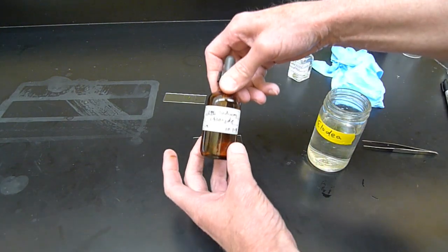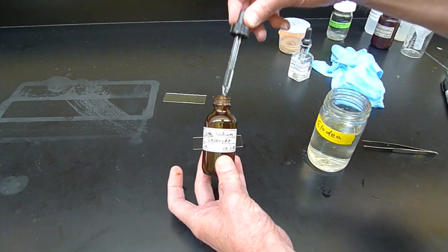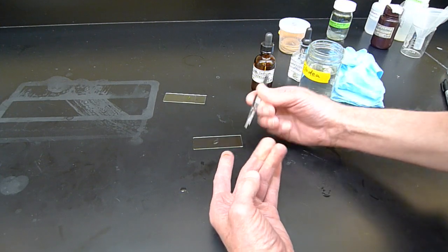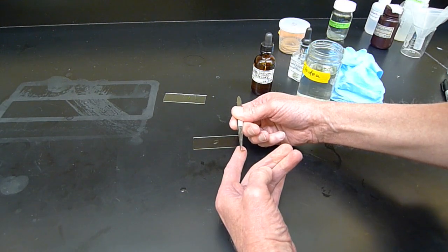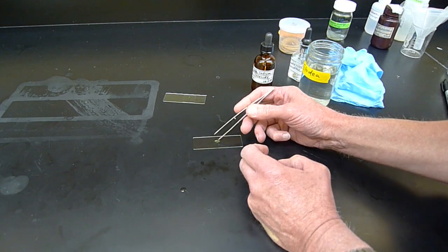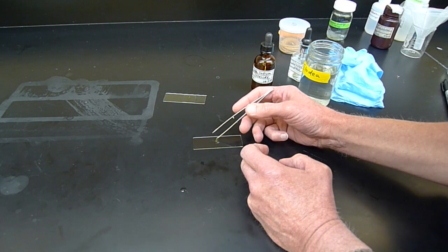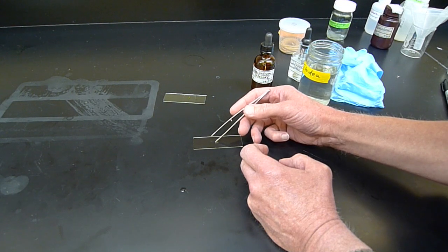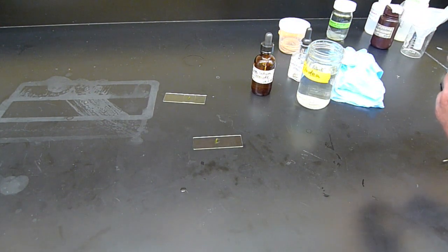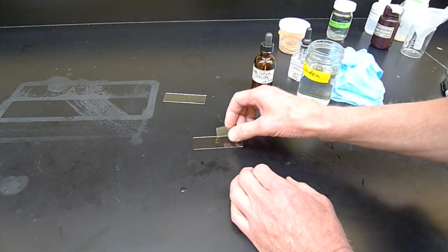But in this case, I'm going to put it in sodium chloride. Put a drop of that on the slide. Put the leaf in the sodium chloride, and then let it sit for a few minutes. Get a cover slip on this one.